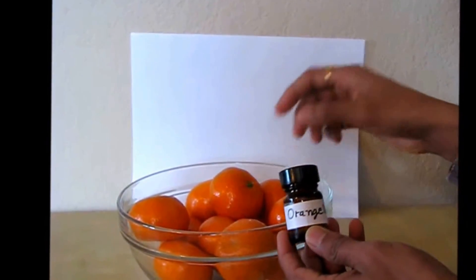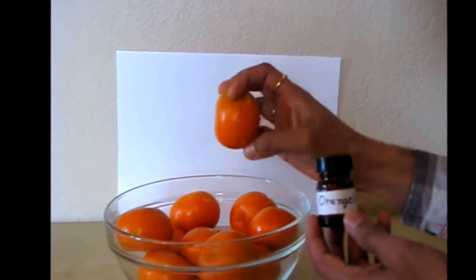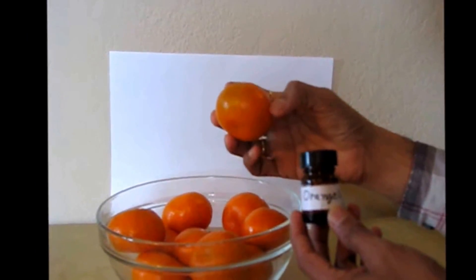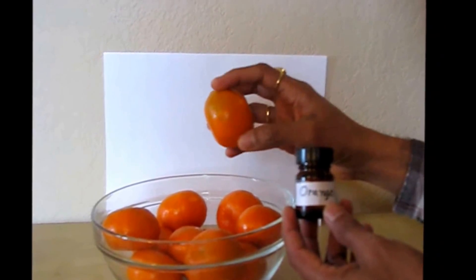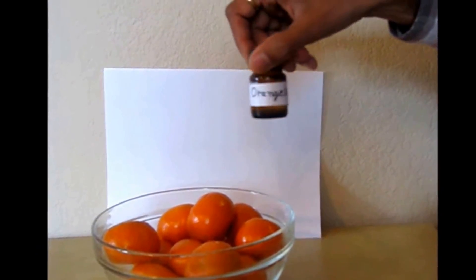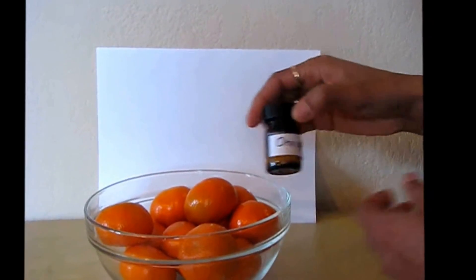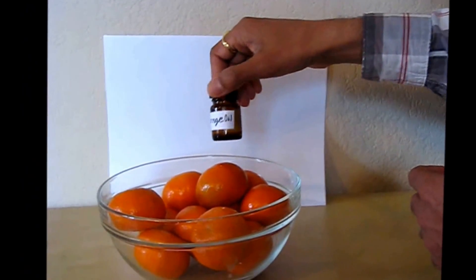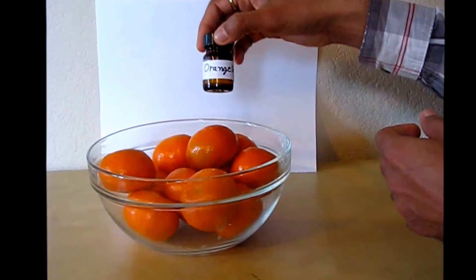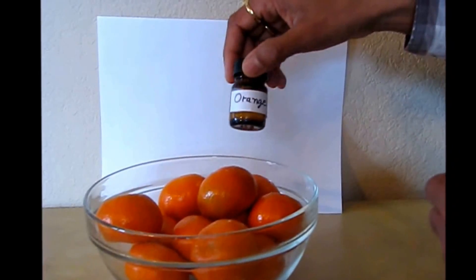Hello, in this video I will show you how to extract mandarin orange essential oil from the peelings. These are small cutie mandarin oranges. I already have extracted some orange essential oil from mandarin here, and I will show you how to extract it using my custom-made homemade steam distiller.